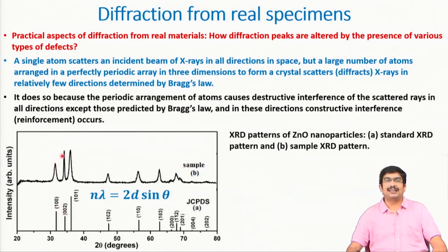But you can see here that is exactly reverse. So, you are getting completely different intensity. Now, the intensity part is getting modified over and above structure factor and multiplicity factor. The intensity is getting modified by other factors we discussed, that temperature factor, absorption factor, so on and so forth.